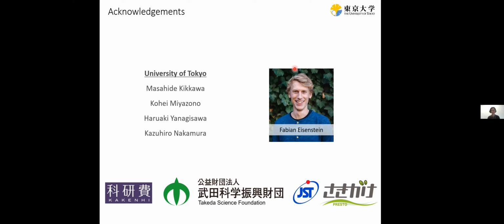Thank you. Alistair? Hi there, great talk. Sorry if you already answered this, my internet briefly cut out. But with the gold grids, you always get these bright spots over the place, and you briefly mentioned you were going to try and reduce those by using a different aperture maybe, but how detrimental, how bad do you think these bright spots are? Do you think that the particles included in the final reconstruction are causing more subtle changes than that?